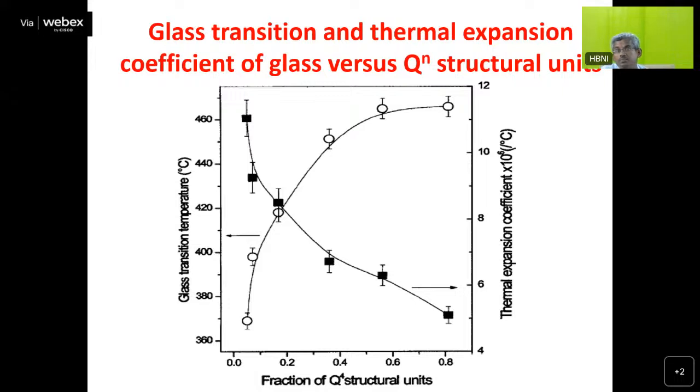Let's continue. Glass is an important material for our Department of Atomic Energy, as well as for other important applications. In many glass-to-metal seals, we have feed-through materials. The thermal expansion coefficient of the feed-through material is an important aspect, because it has to match the metallic material used, since the feed-through material will be covered by stainless steel or Inconel or whatever material. The thermal expansion coefficients of the glass and the steel should match, then only will it form a very stable seal. Otherwise, there will be inhomogeneities, the seal can break and material can come out.